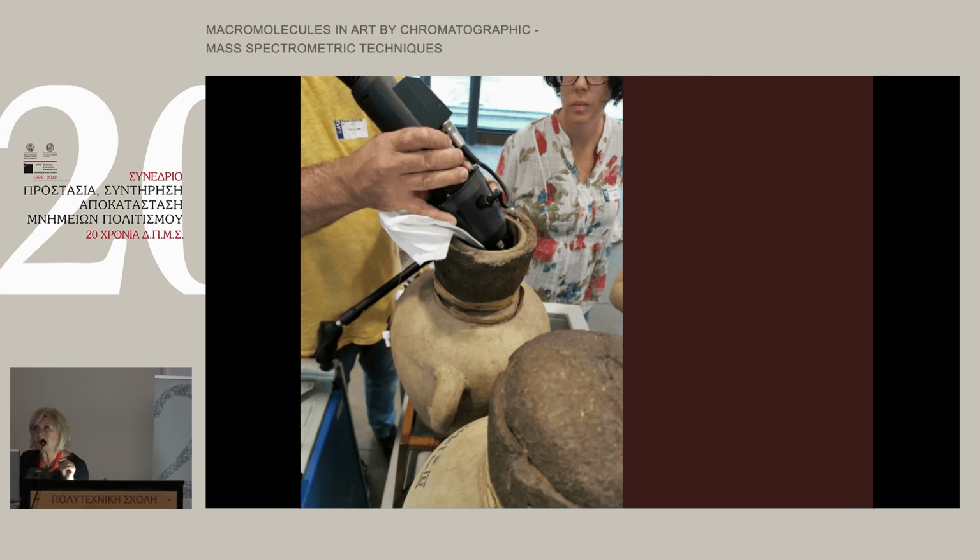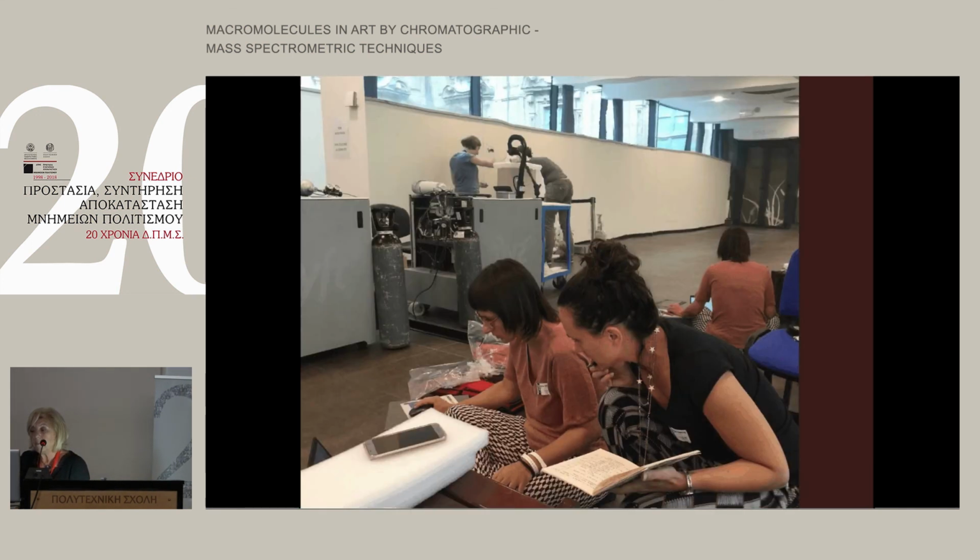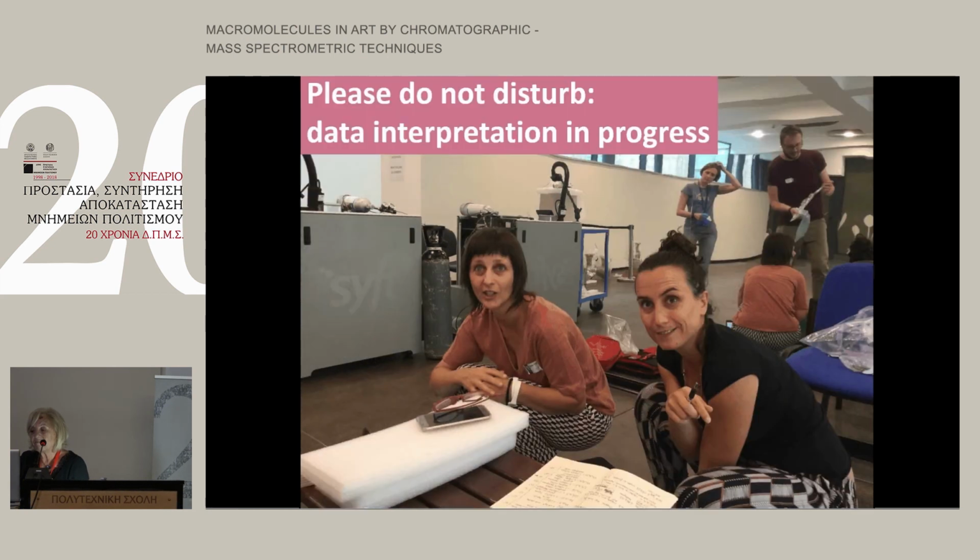And in some cases, it's possible simply to open the amphora, to put the probe, and to analyze for 60 seconds what is the air inside, and to obtain the result. And again, another example, and they are working, so Francesca Modugno and Ilaria Degano working with me in my research group. And they say, please don't disturb, I was taking photos.